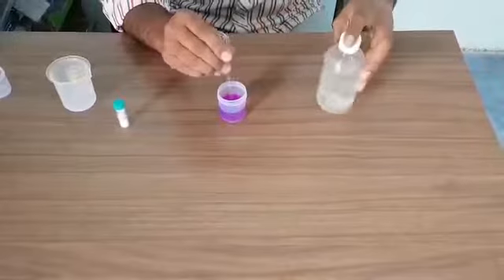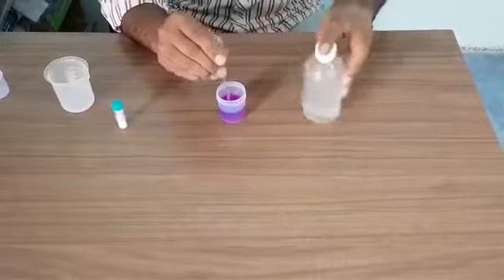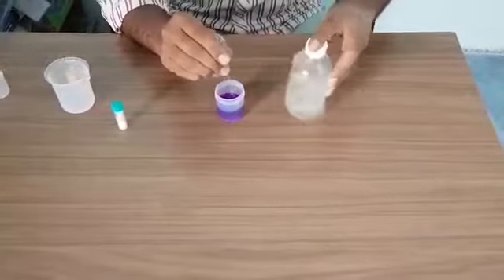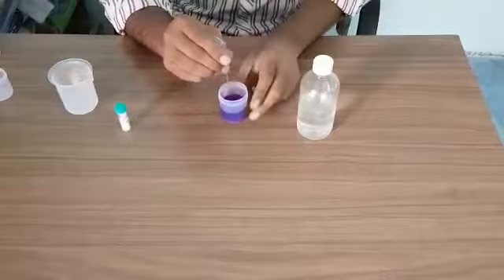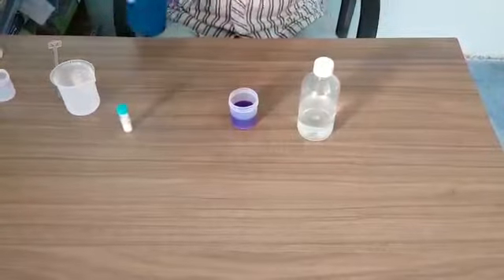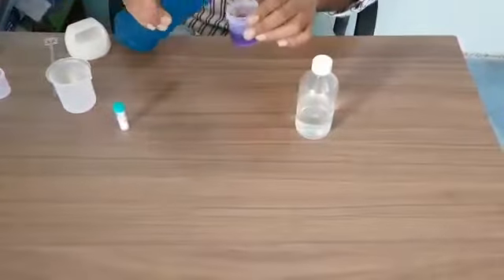In between, you can shake this solution as well so that sodium hydroxide and sugar will get dissolved into the water. Here we can add more water to this.